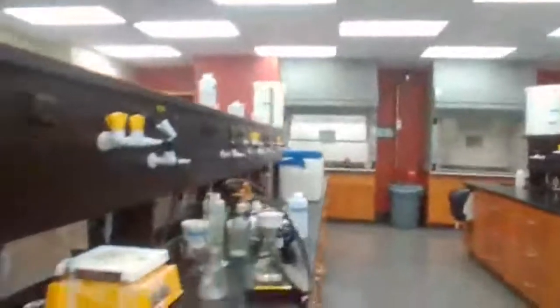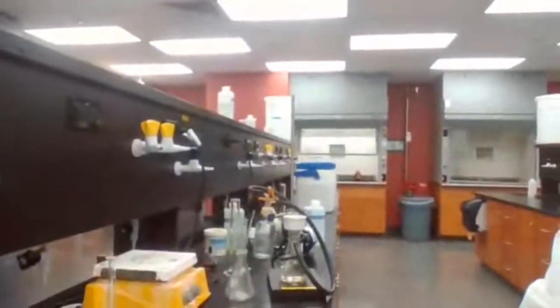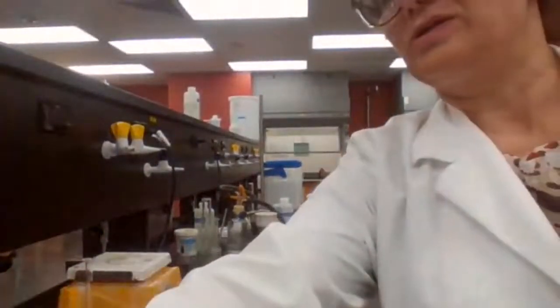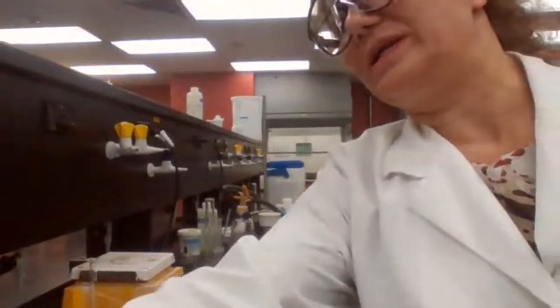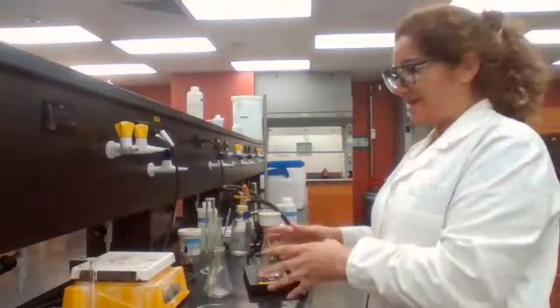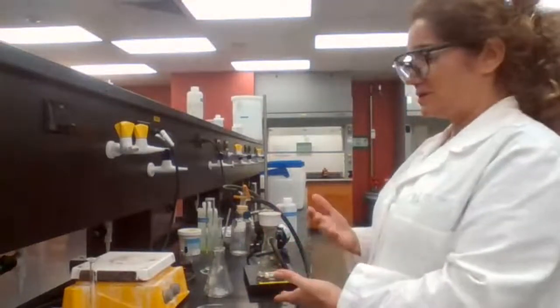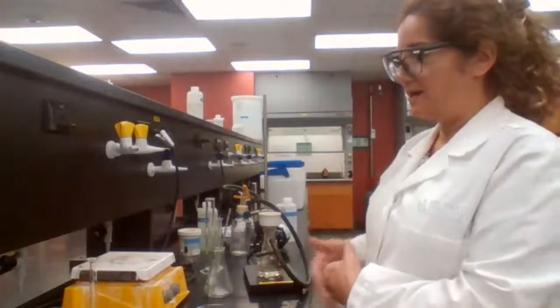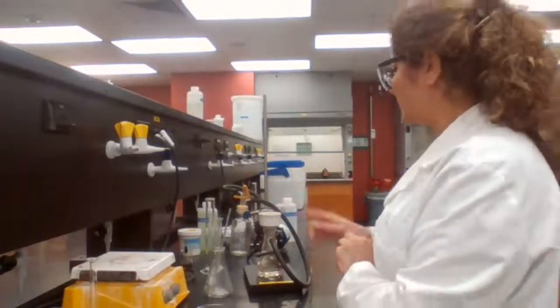At the end of this experiment, after we have a dry sample, we need to measure the melting point. So I'm going to get a melting point apparatus, set it up here so you can see, performing the melting point again with the final product.